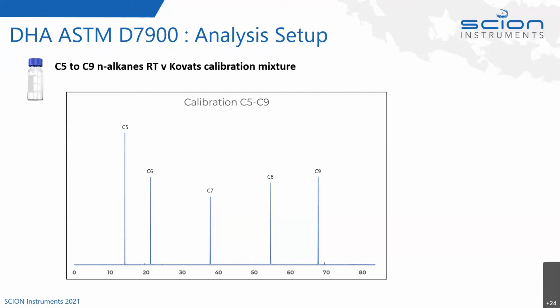The software uses more than just the retention time. It'll use a little bit of information that you give in what's called presets. You can tell if it's more of a reformate, or what sort of history the sample has, and that will guide the database in a certain way when it looks up the Kovats database, and it will then label the peak for us.